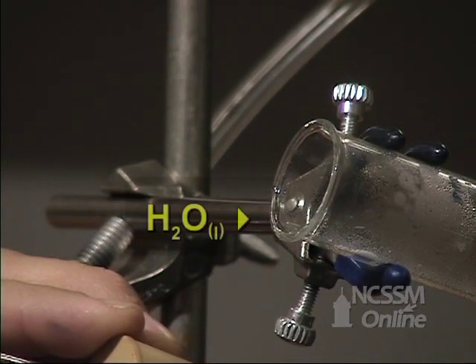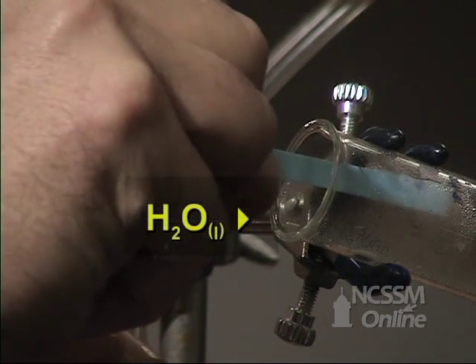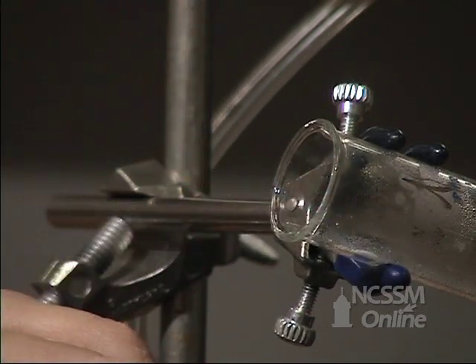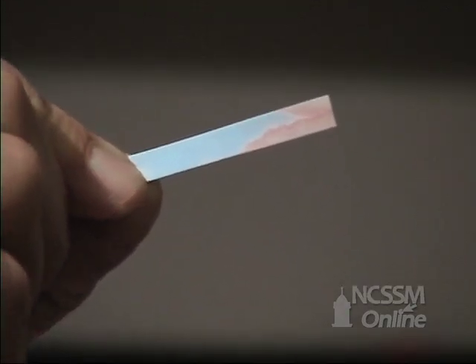The water vapor that's produced will condense at the top of the test tube, and we will test for the presence of the water using some cobalt blue paper.